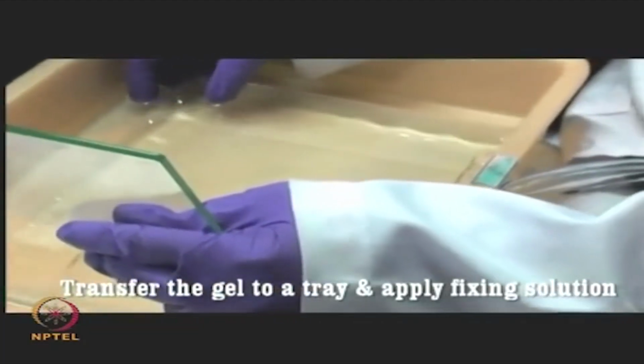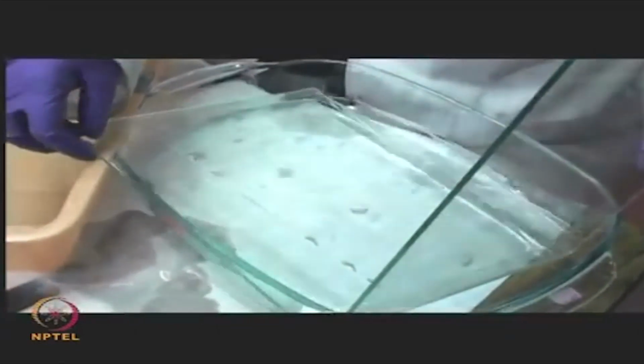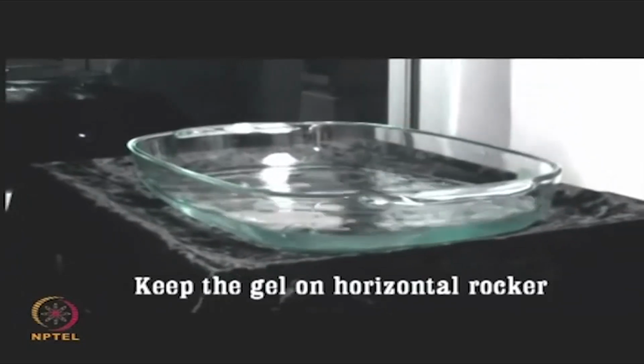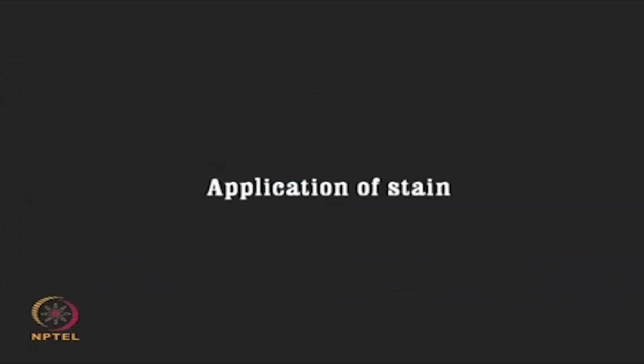Then, transfer the gel into the fixing solution by gently sliding it off from the glass plate. Place the tray on a mechanical shaker for an hour to ensure that the protein spots get fixed onto the gel, thereby minimizing any diffusion. Gel staining.